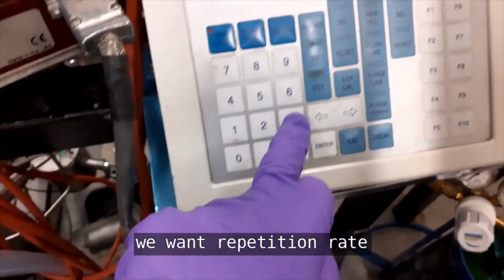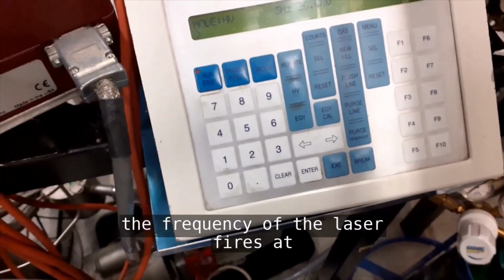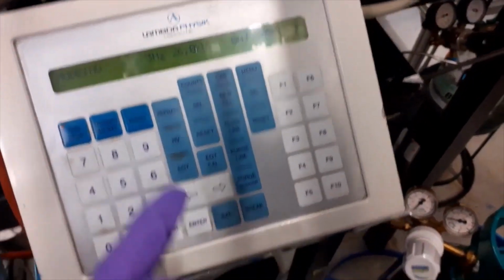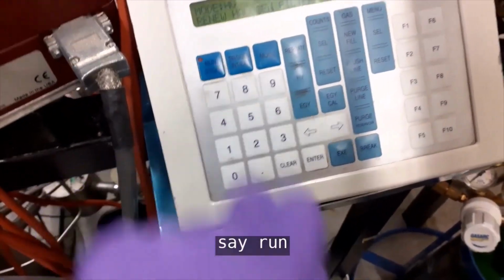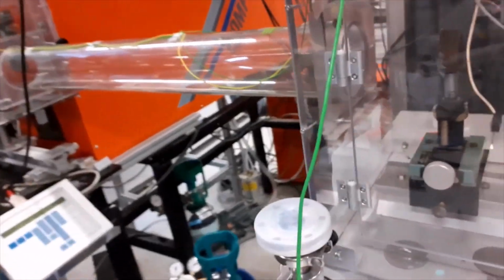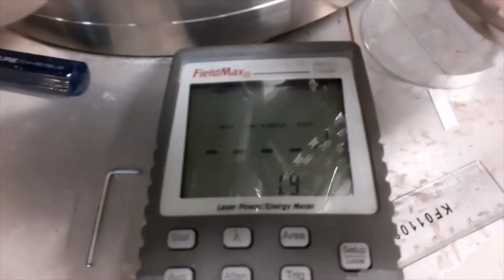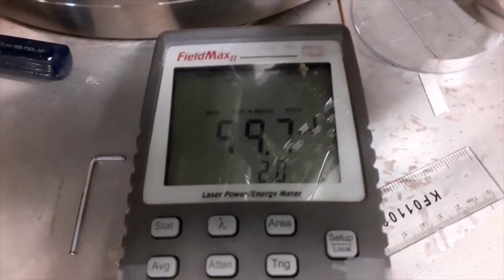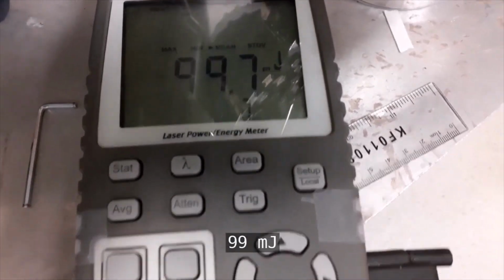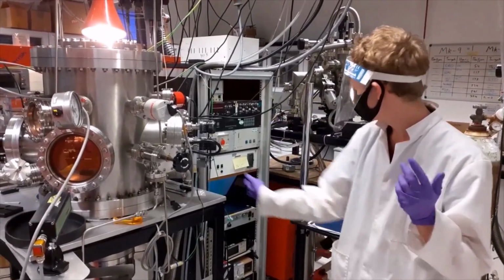We want repetition rate, which is the frequency that the laser fires at, and I want 3 Hertz. And then I'm going to just say run, enter, and execute, and then the laser should fire. You can see it striking the detector there, and it's giving us 99 millijoules. Okay, so we've got the laser set to the energy we need.